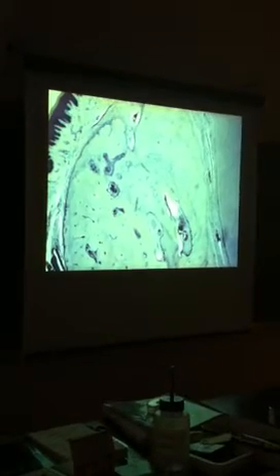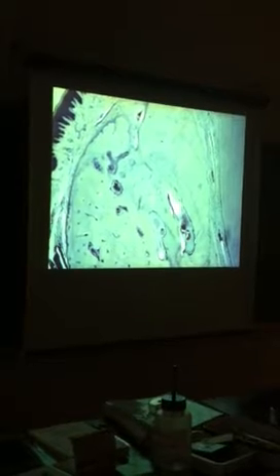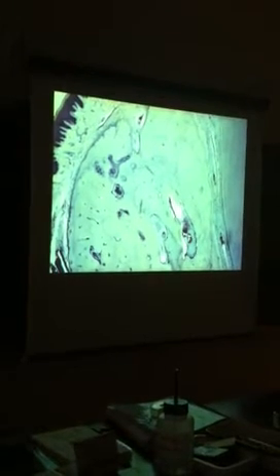That thing. Alveolar bone. Then comes next to the right, periodontal ligament. And then what's at the outside edge of that dentin? Cementum. Cementum. That's gonna work. Oh, so small. The little edge of the dentin in the root area.